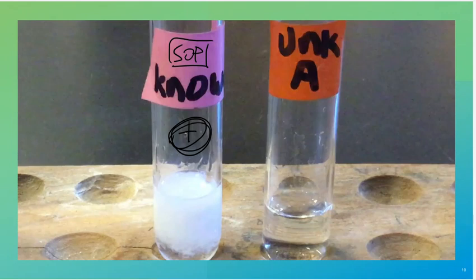So a proper laboratory might give you a SOP, and the SOP will be like, hey, take this because we know in this case chloride is present. And because chloride is present, we know you should get a positive test. And you're going to test this along with this substance that you think has chloride there, right? I mean, that's the whole point of this. So that way you can do a quick comparison between a known and an unknown. Just for points of reference, just to make sure that the reagents work, just to make sure that you're seeing things the proper way. That's what the knowns are all about.